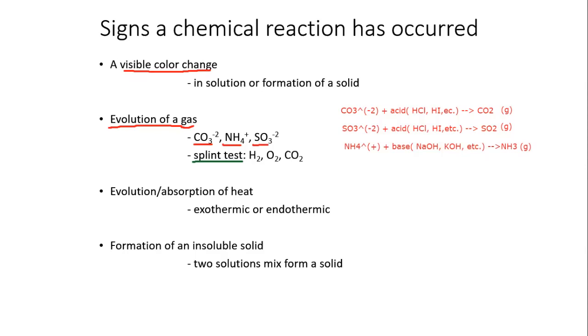And so here, if we have hydrogen gas, the splint tests positive for hydrogen gas when you hear a popping sound.